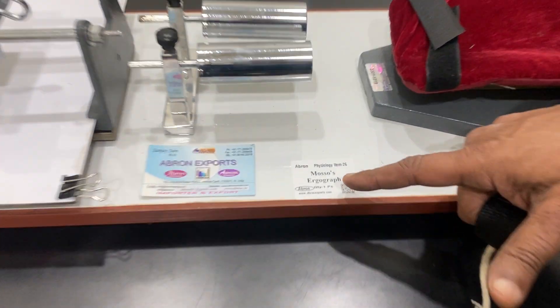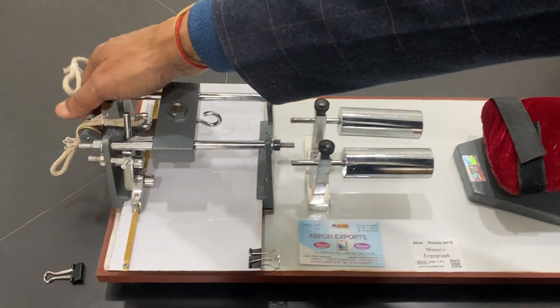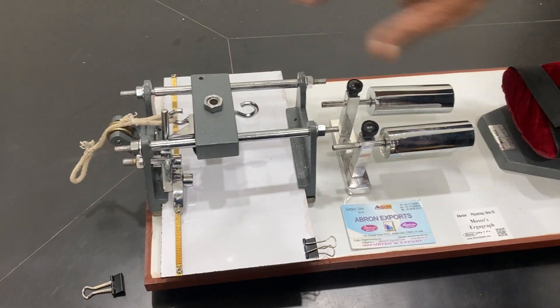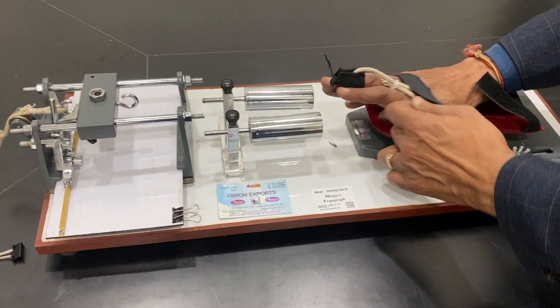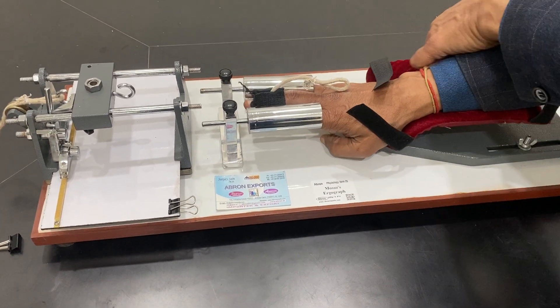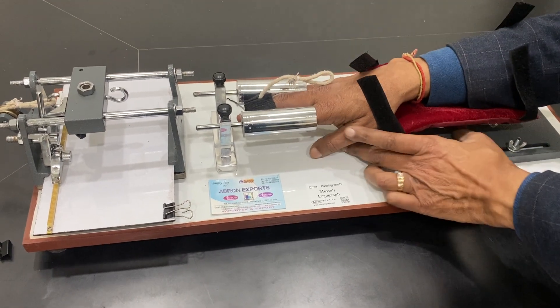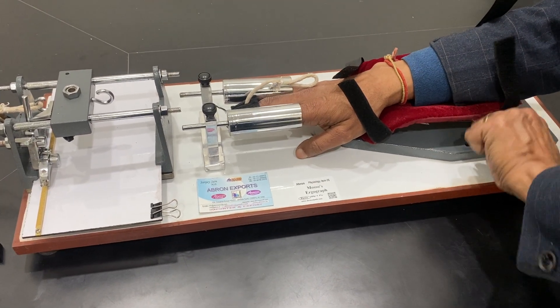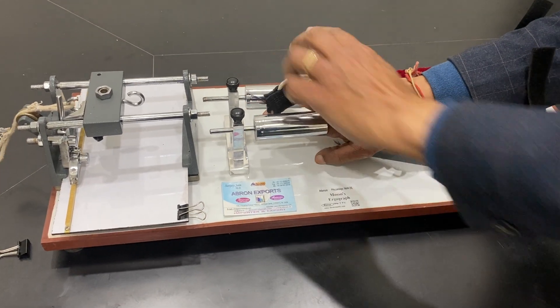This is Mosso's ergograph, where we check the fatigue of the finger. A weight of about 500 grams is put on this, and the hand is placed here. Two fingers are placed in this, and adjustments are done so that the hand is comfortable. There are adjustable locks here.